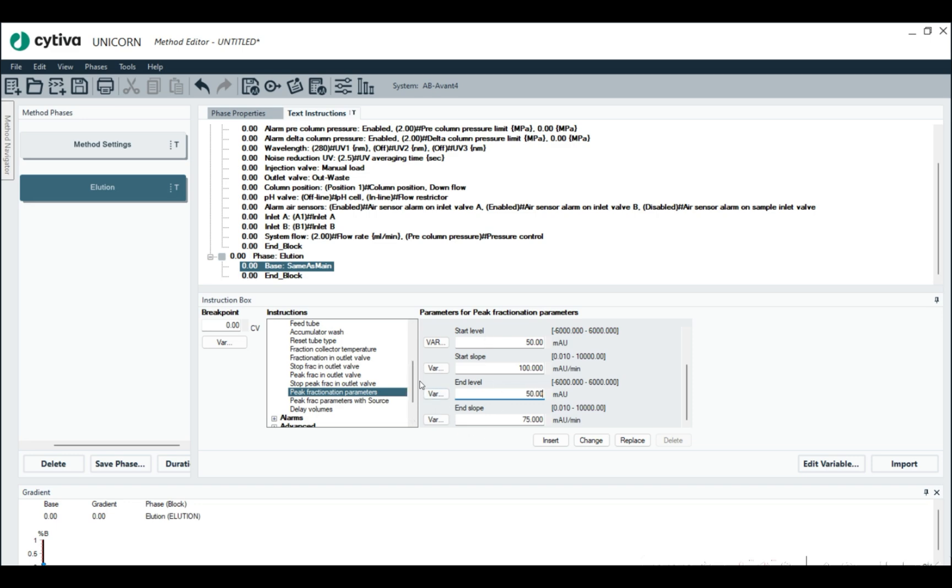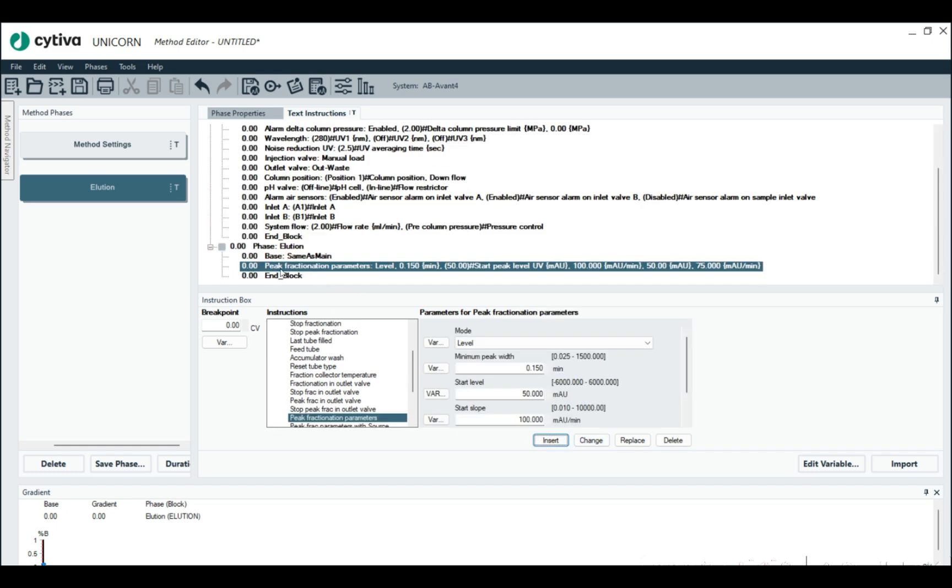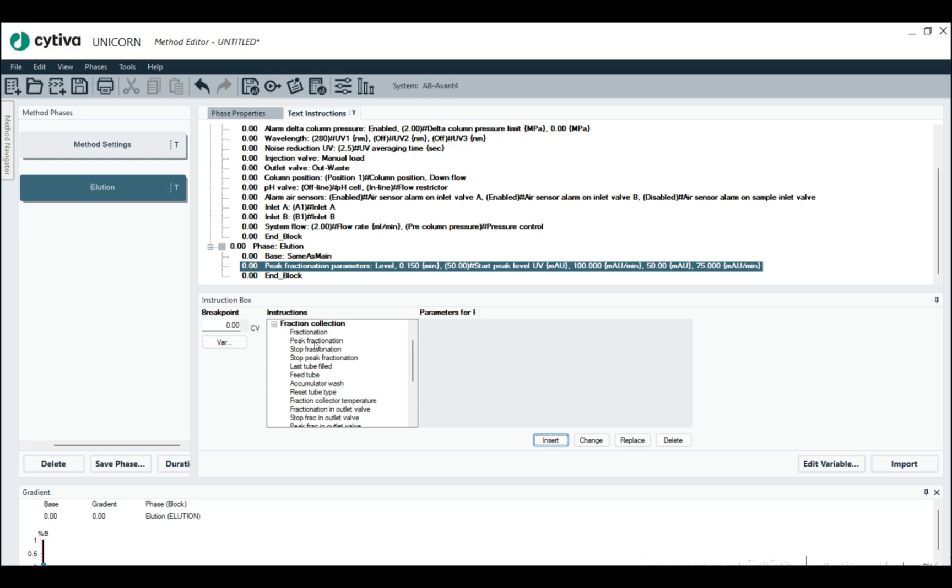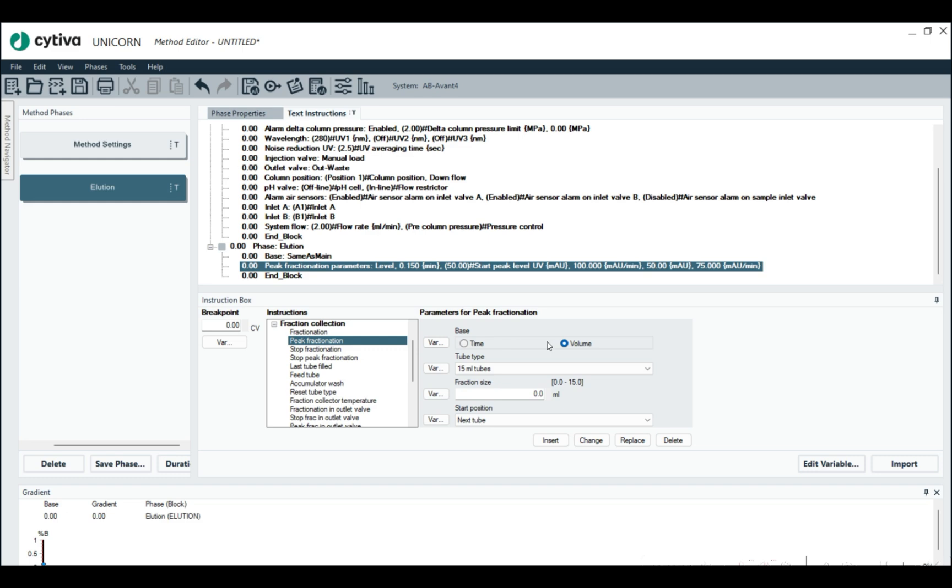So insert. Then right after that, we can finally do peak fractionation and we're just going to do 15 mil tubes. We're going to do the basis volume and fractionation size is going to be 15, insert.